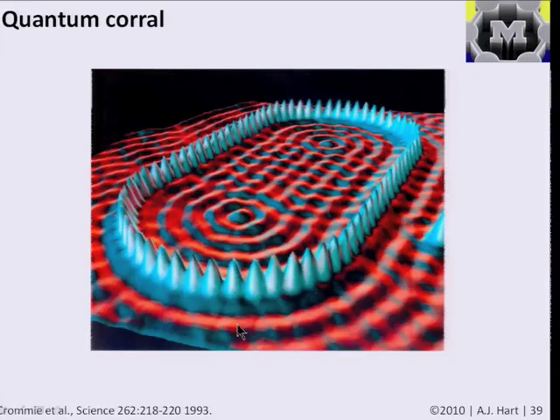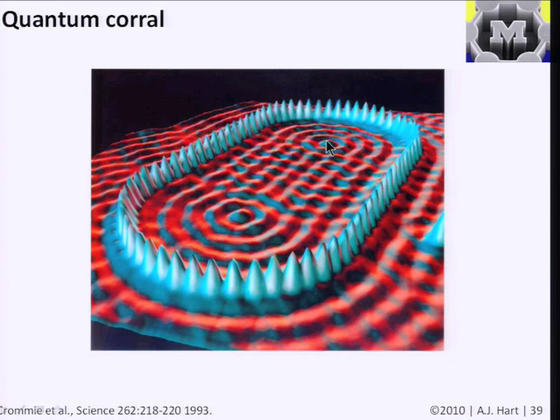And the STM was used to make this image that we'll start to see next time when we learn about why this image looks like so, but to map the electron density of a ring of atoms that were placed on a metal substrate. And remember, here we're seeing the existence of one real atom, and here we're seeing the reflection of the electron waves that are emitted by this atom because they interact with the sort of fence of electron density that's around it. So that might sound a bit vague now, but we'll start to see next time why this picture exists and how it's made, and it's kind of an analogy to confining the energy levels in a small space.